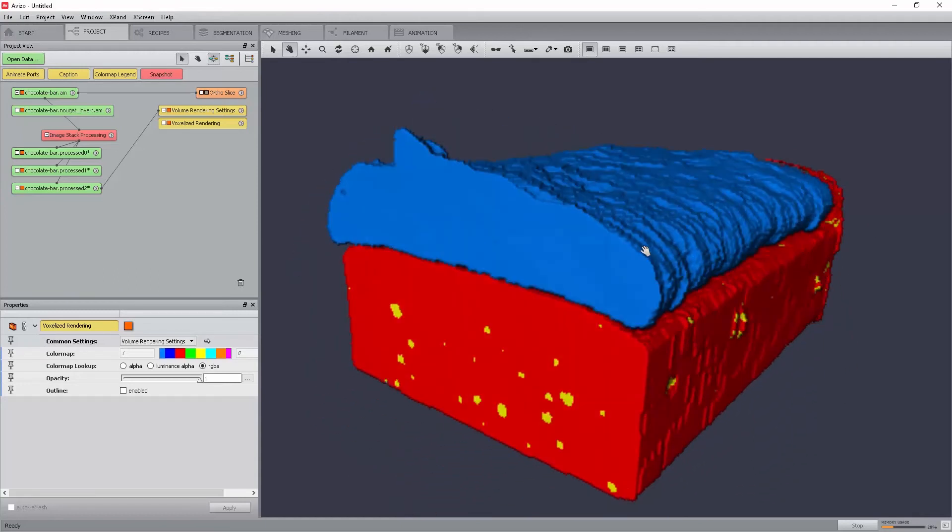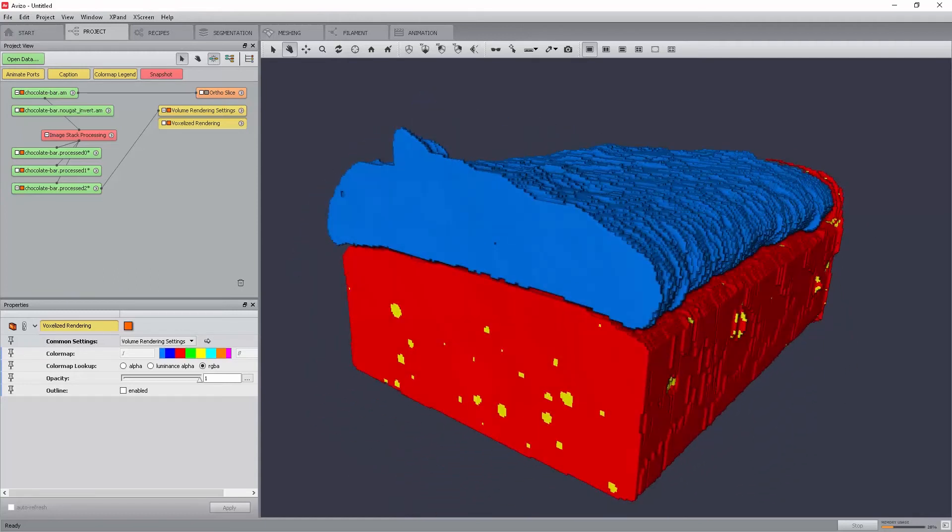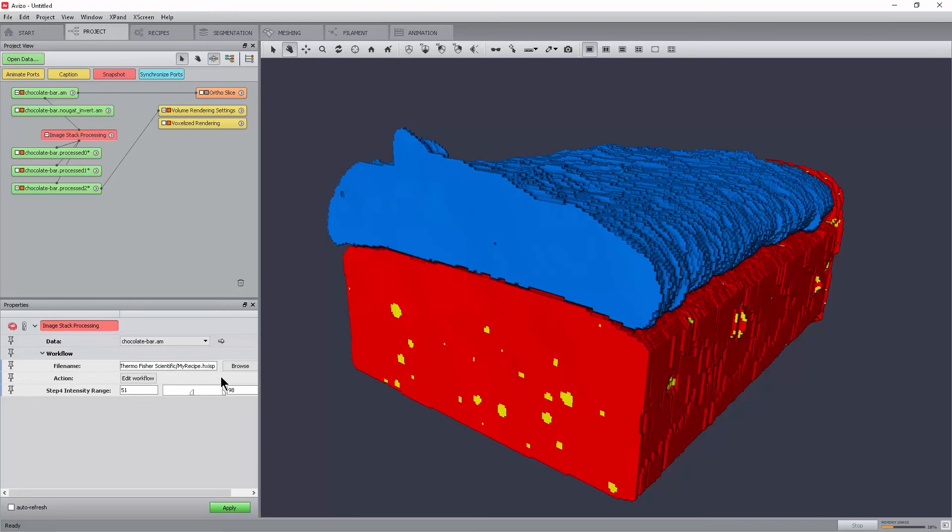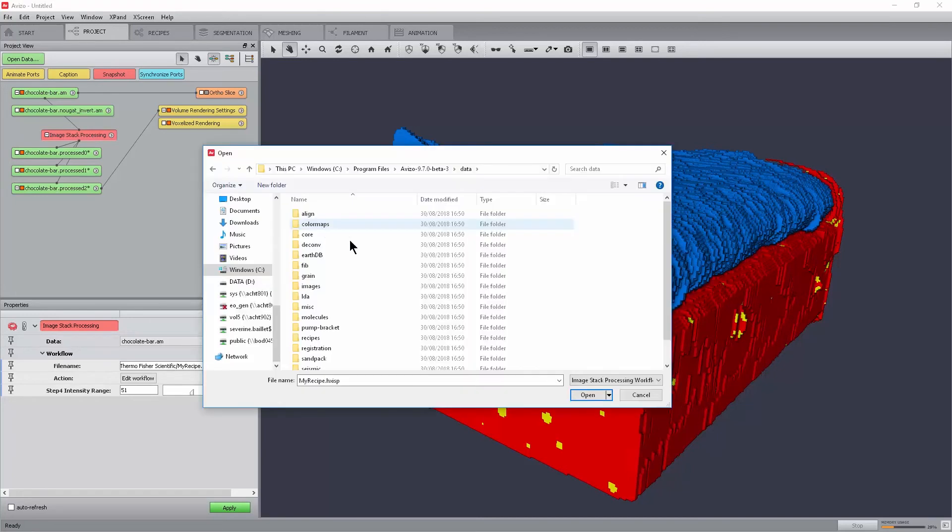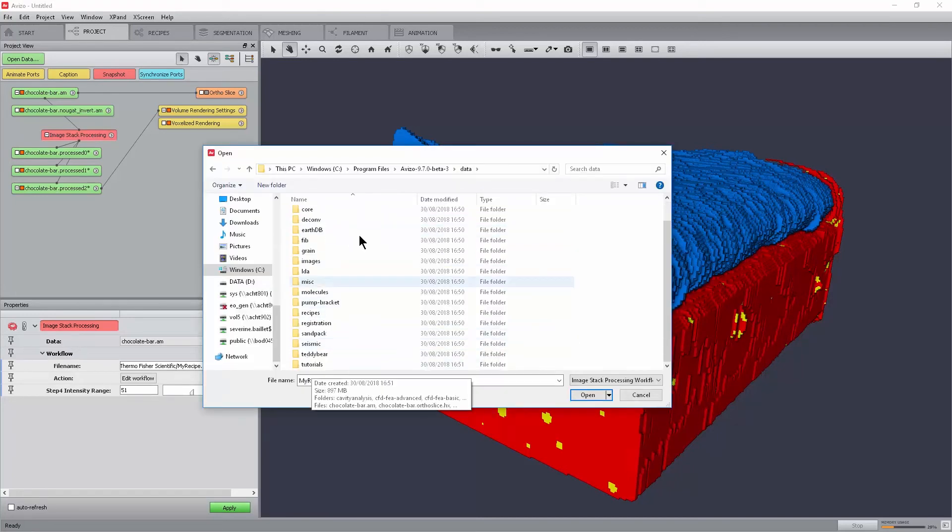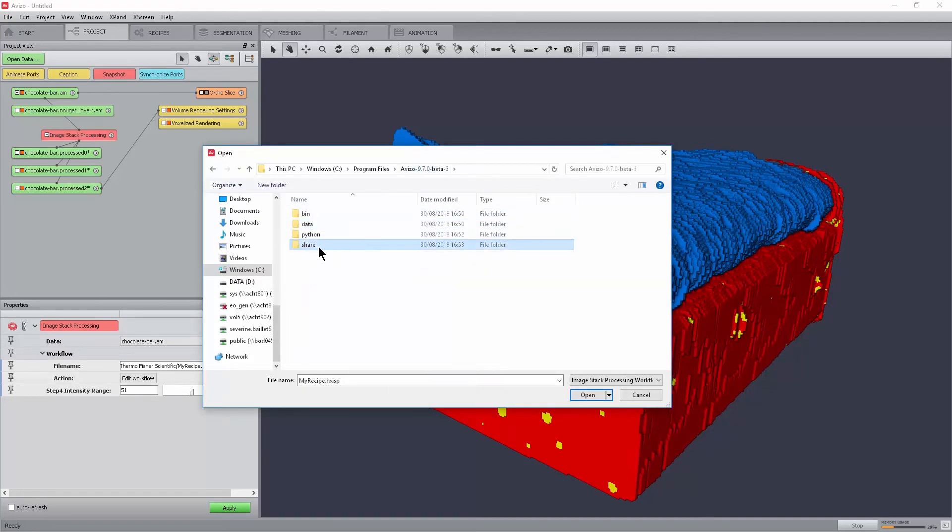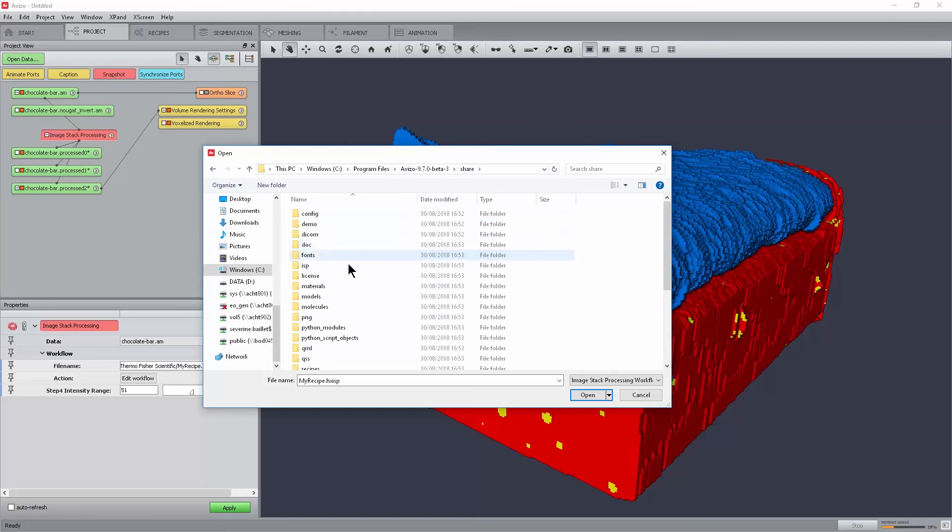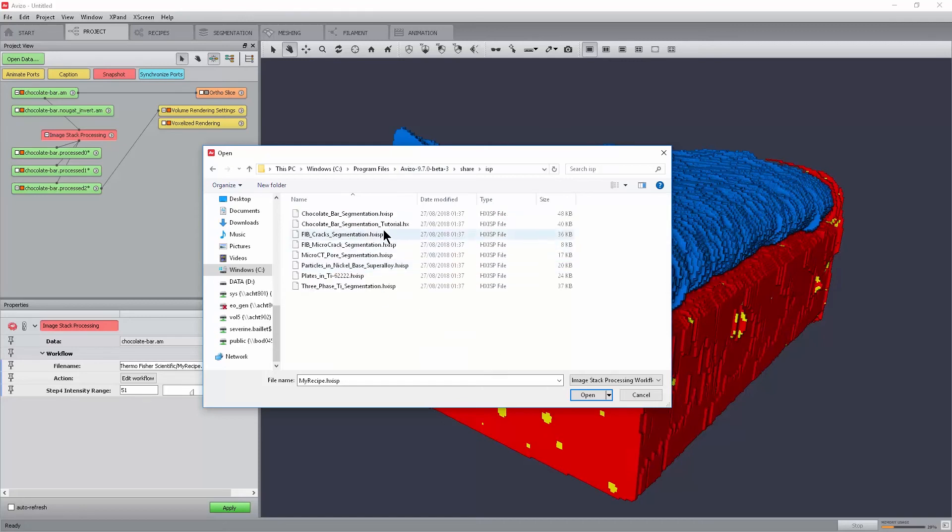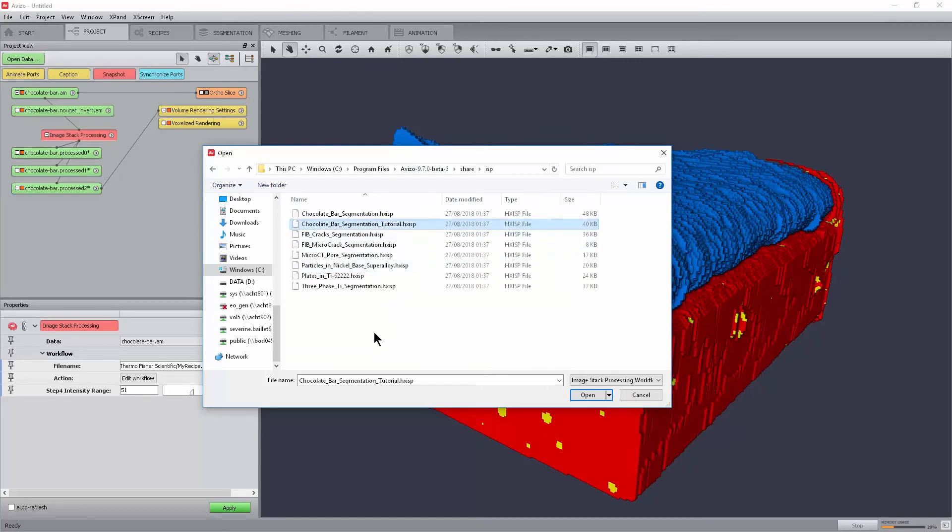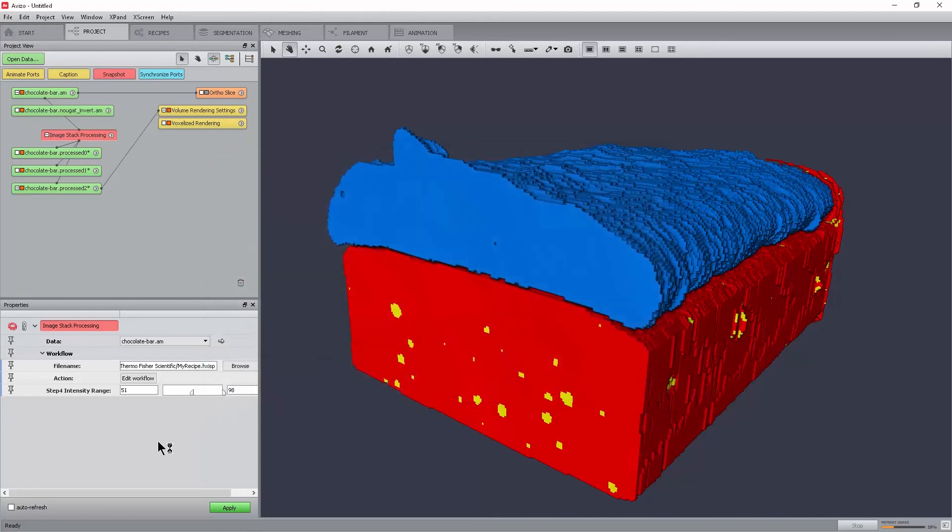The workflow described in this tutorial can be found at the following location: Share ISP chocolate bar segmentation tutorial.hxisp. To load it, simply click the Browse button in the image stack processing module and select the recipe. We can then click on the Edit workflow to see the details of the recipe.